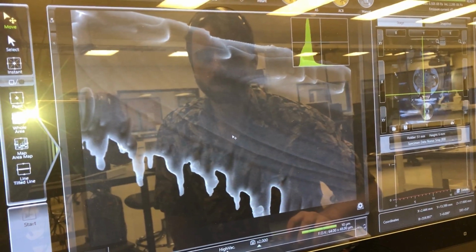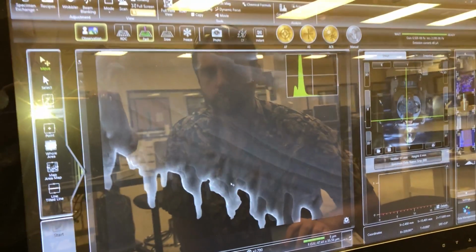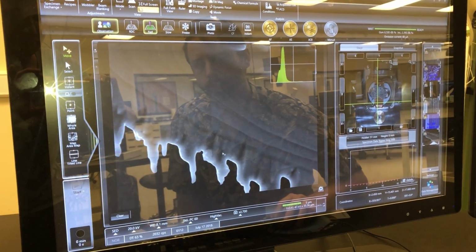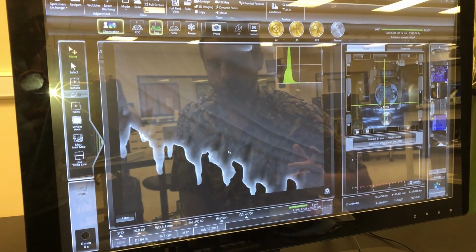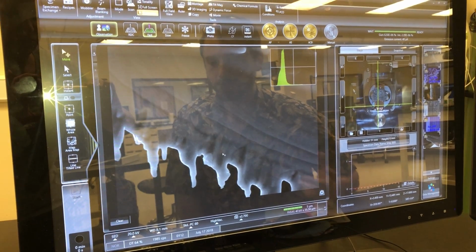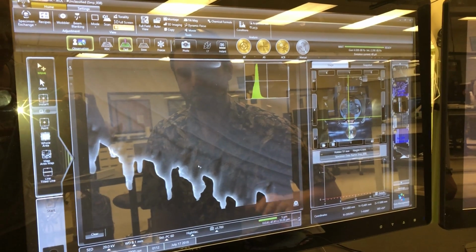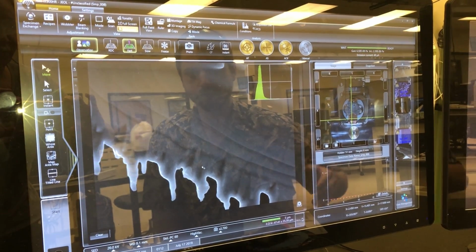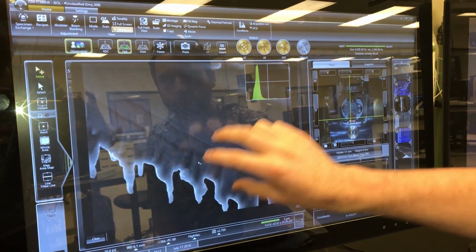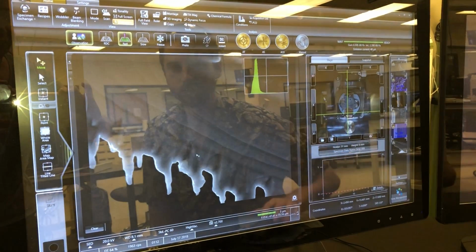Something else that we can do though is to choose any region that we want to examine and say, if I hit this with really fast electrons, I can get it to make X-rays to produce really energetic light, kind of like the flame test in a chemistry class, just at a higher level of energy. And since each element gives off different specific energies, we can learn what atoms are in each different region of our sample. Maybe the teeth are made of something different than the whisker around them.